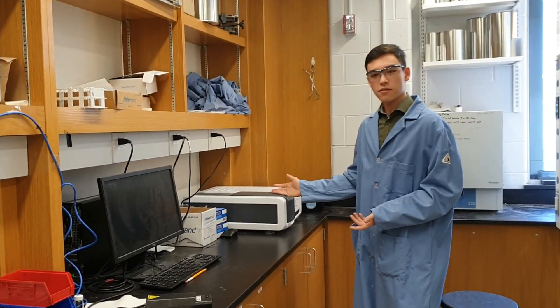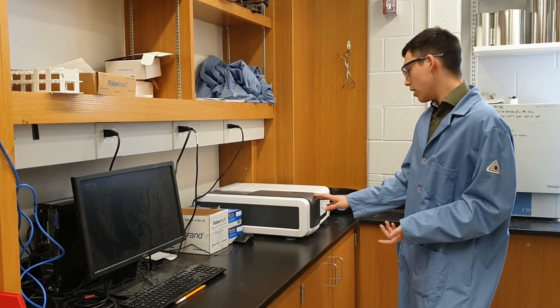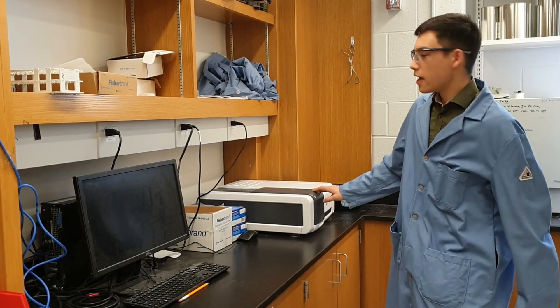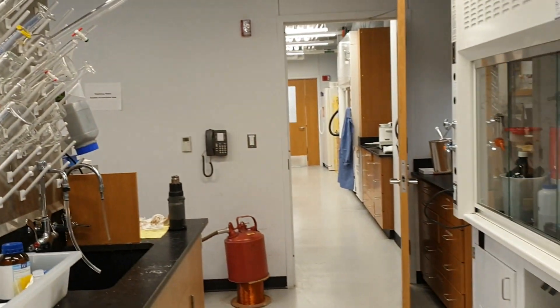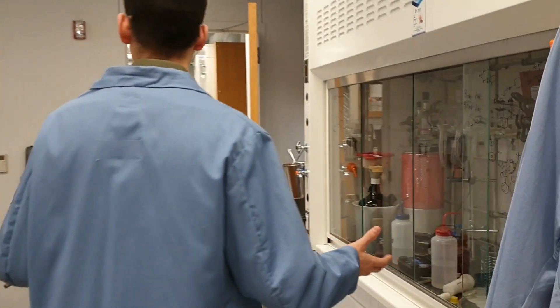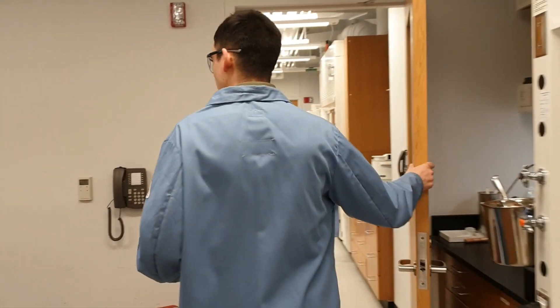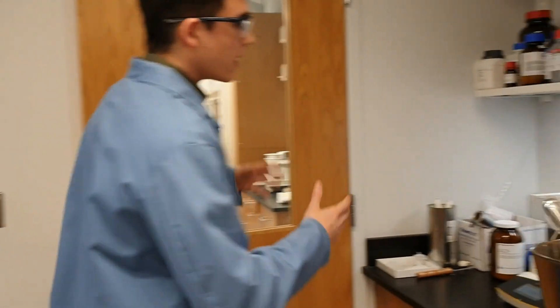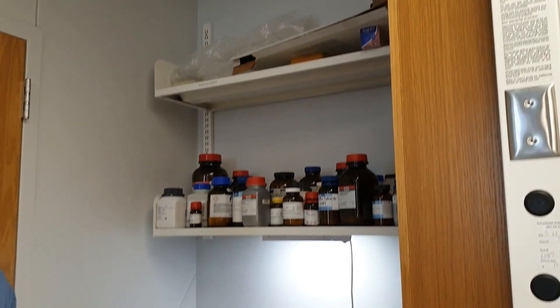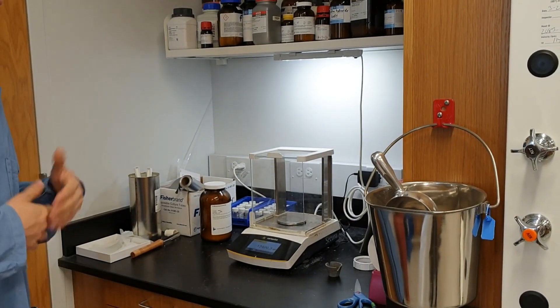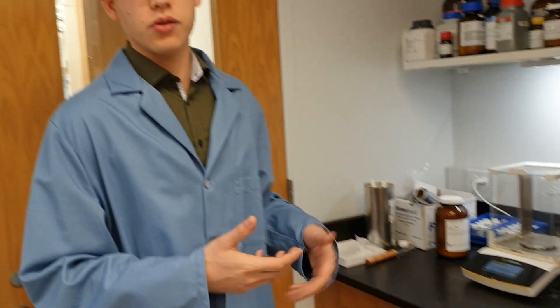Here you can see one of our equipments, our computers, and a drying oven. Anyways, let's go ahead and continue walking through our space. Every quadrant has their own scaling area with essential chemicals, which you will need in everyday lab life, as well as some specialized chemicals used for your own chemistry.